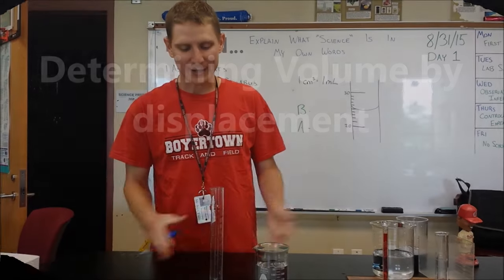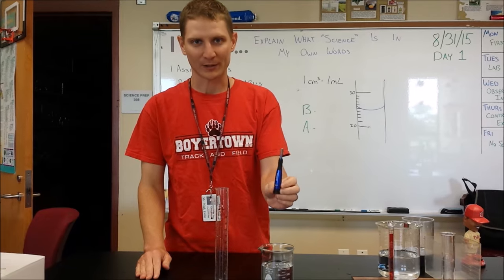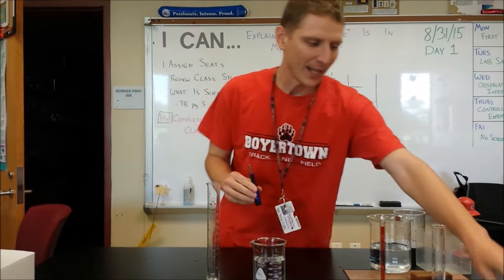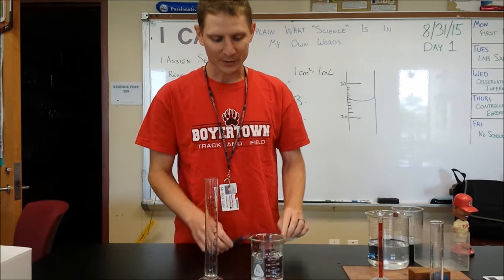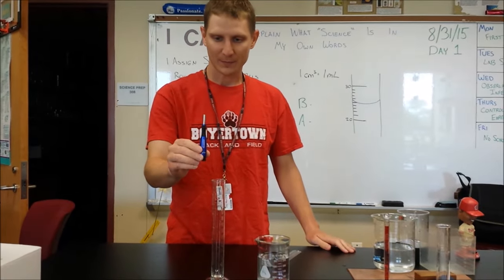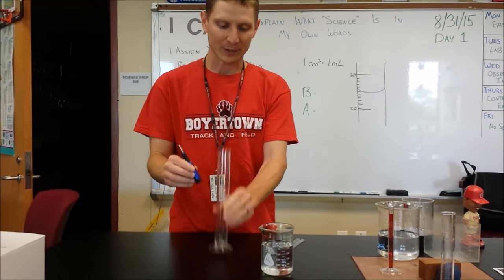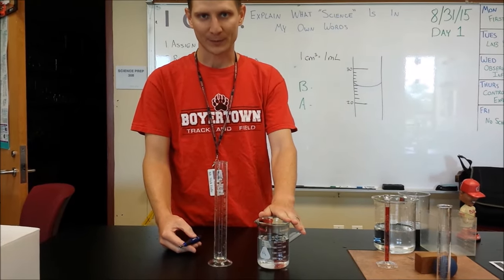We're going to do is figure out how to find the volume of an object like this, which is an irregularly shaped object. And we can't use our metric ruler to help us. So instead we're going to use displacement. For a smaller object, such as this, that will fit inside of a graduated cylinder, all we need is our graduated cylinder and a beaker of water.